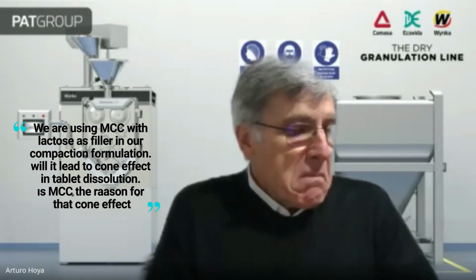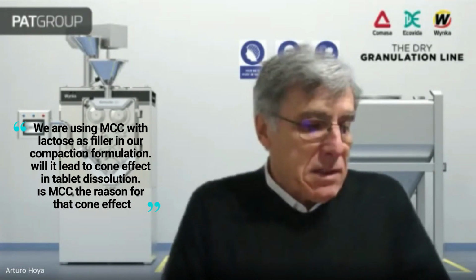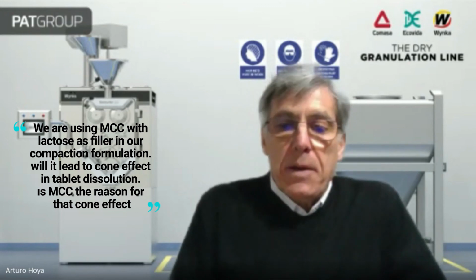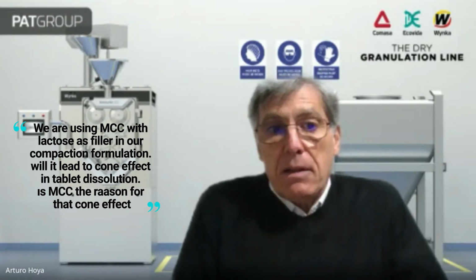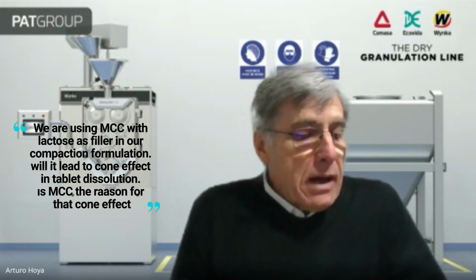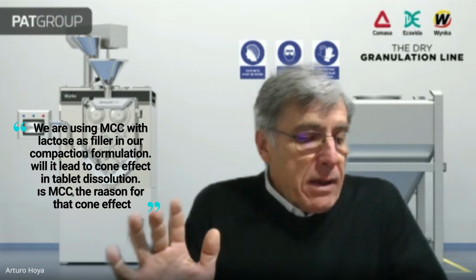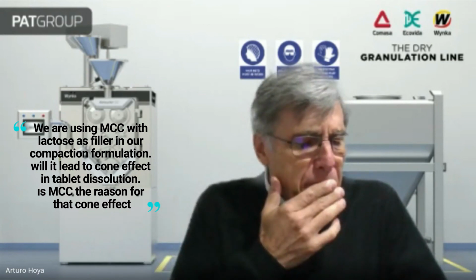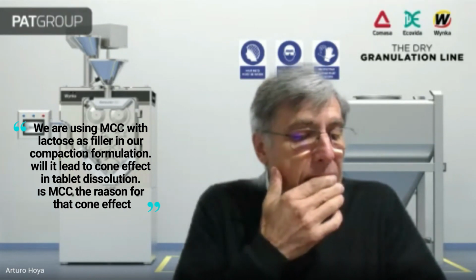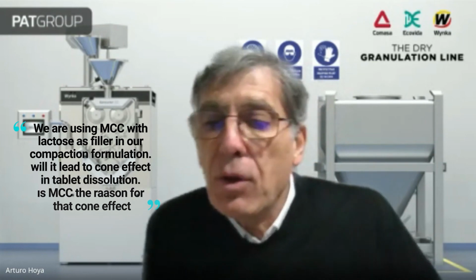Perhaps this is the reason. It's insoluble, so MCC will stay in the bottom during all the dissolution process. I think that is the answer. Okay? Okay, thank you, Osen.